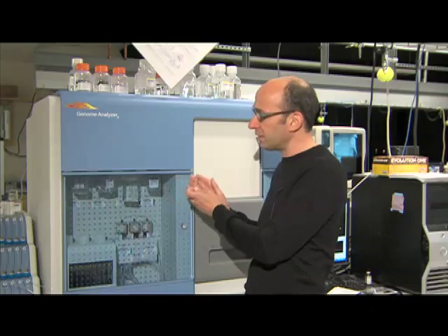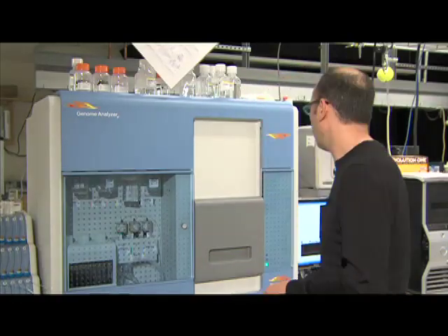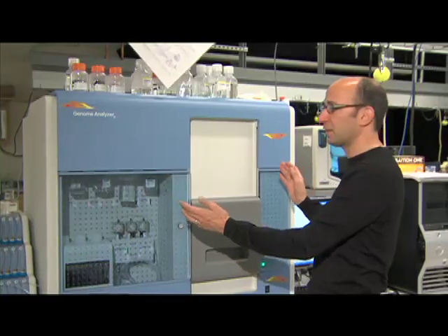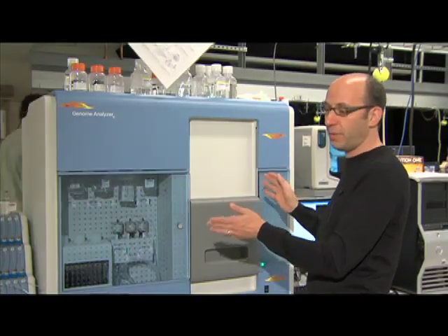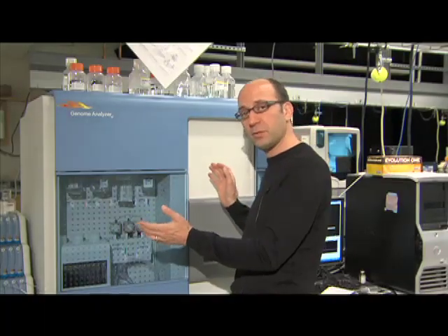So I showed you before that we had a capillary electrophoresis with 16 different capillaries running simultaneously, allowing us to do 16 different reactions, or in the next iteration, 96 different reactions. This is really a completely different scale. Now we're sequencing 100 million at once. And so this machine here would actually let you carry out 1 billion base pairs per day of DNA sequence. In a 1, 2.5, or 3 day run, you'd be able to get 3 billion bases of sequence, on the scale of a whole human genome.